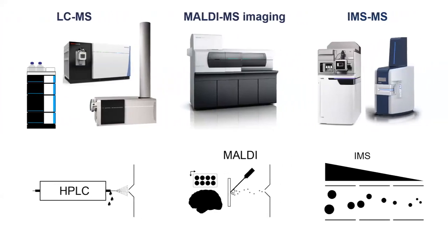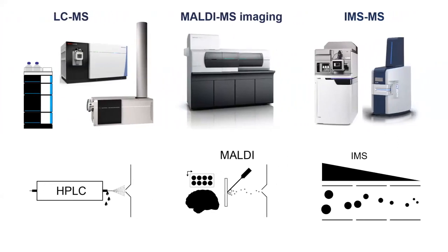And so far, we are also not only limited to these 3 techniques, we also have the ion mobility dimension. Maybe who works with IMS data already? I guess it's even less people. No, seems to be even more than imaging. Pretty interesting. So, this is also an additional dimension, and now we can also combine IMS.